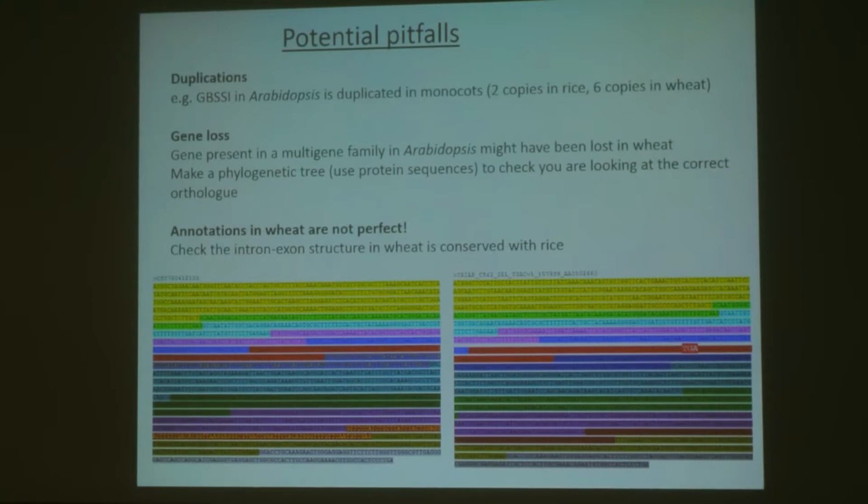In this we've highlighted each exon in different colours. If you look, for example, the purple one is the same length as the purple one in wheat, and we would expect it to be exactly the same, maybe plus or minus 3 bases, because you might get one extra amino acid. So that's something to check as well, that the gene model in wheat looks feasible. Because like Nikolai said earlier, some scaffolds are quite short, so the end of the gene might be truncated in wheat.